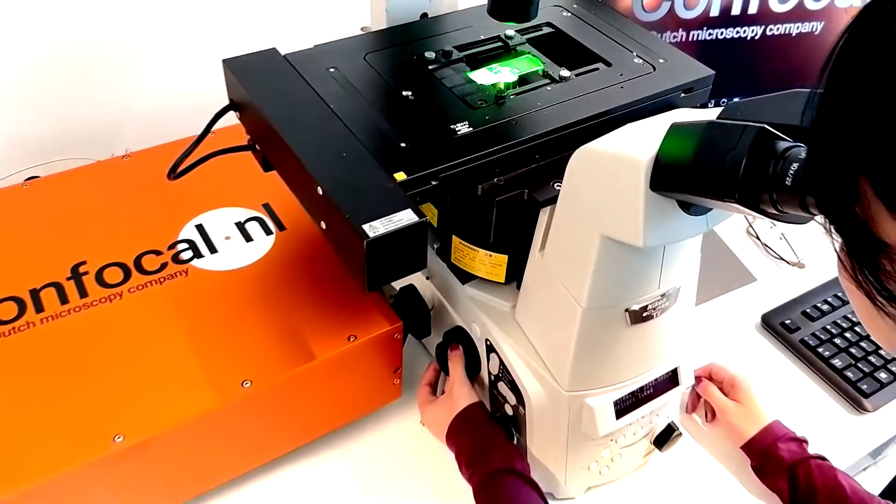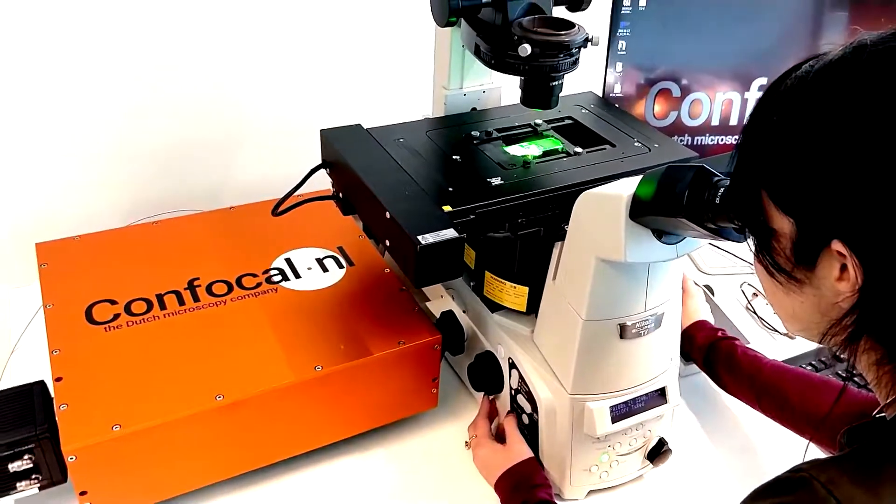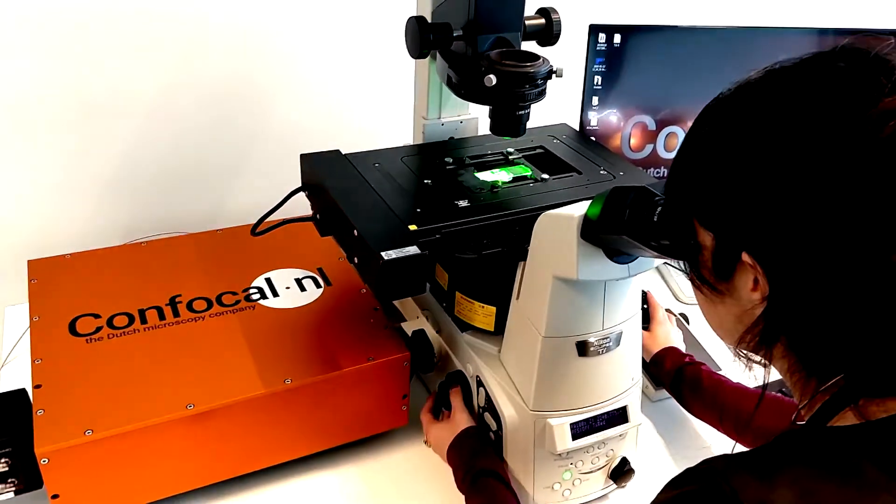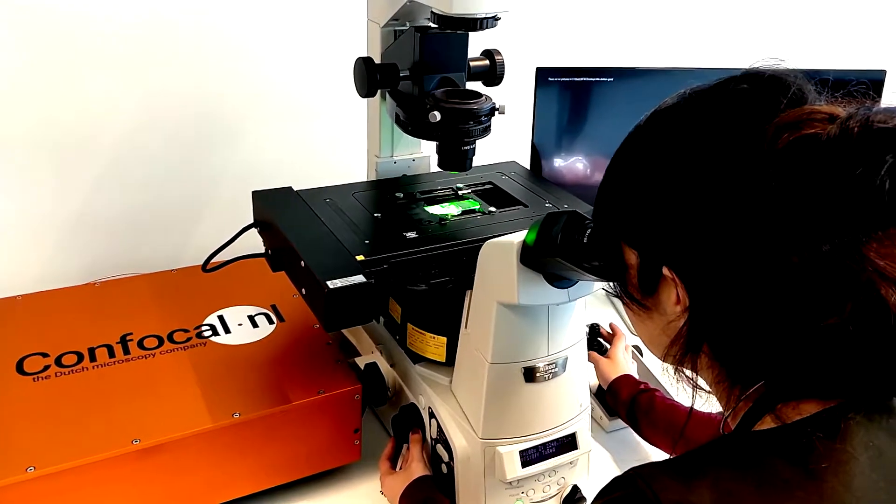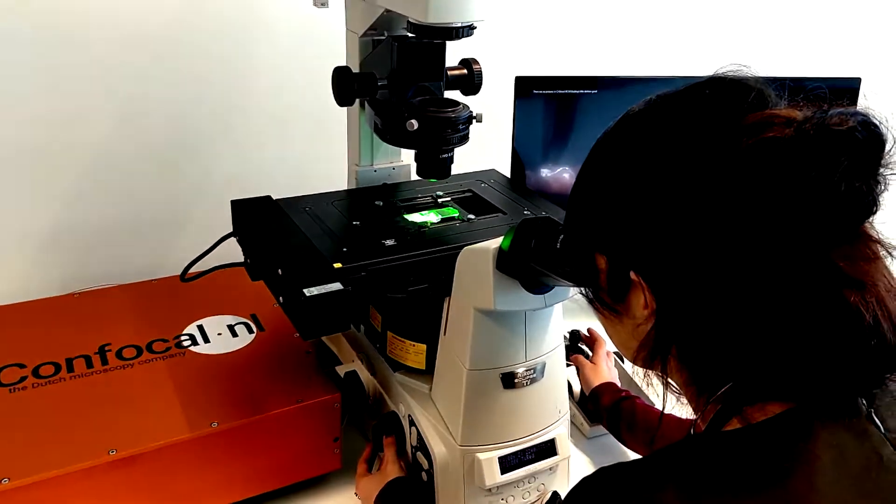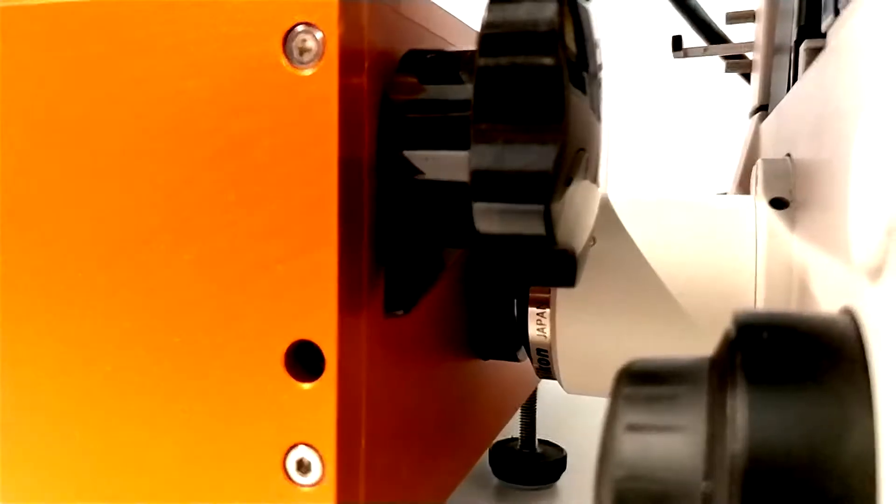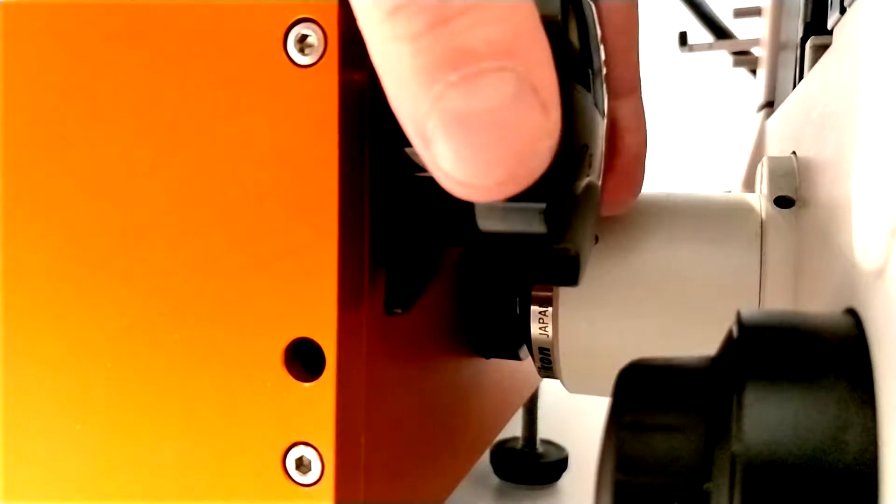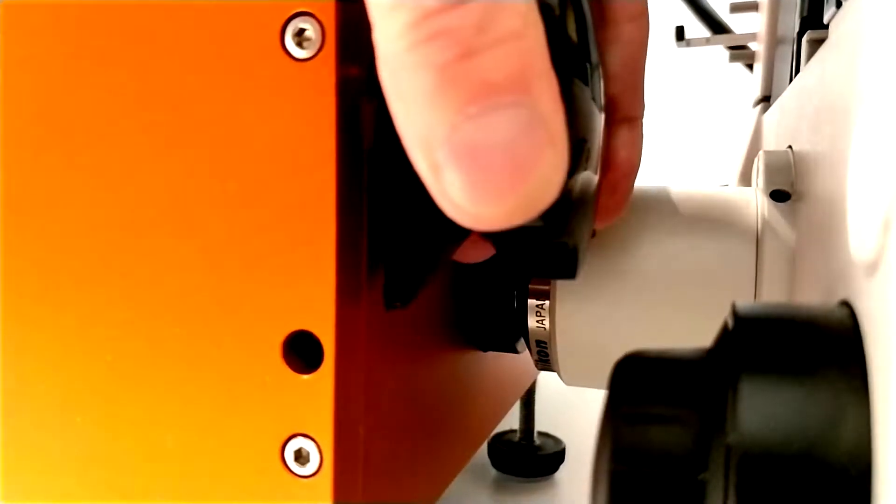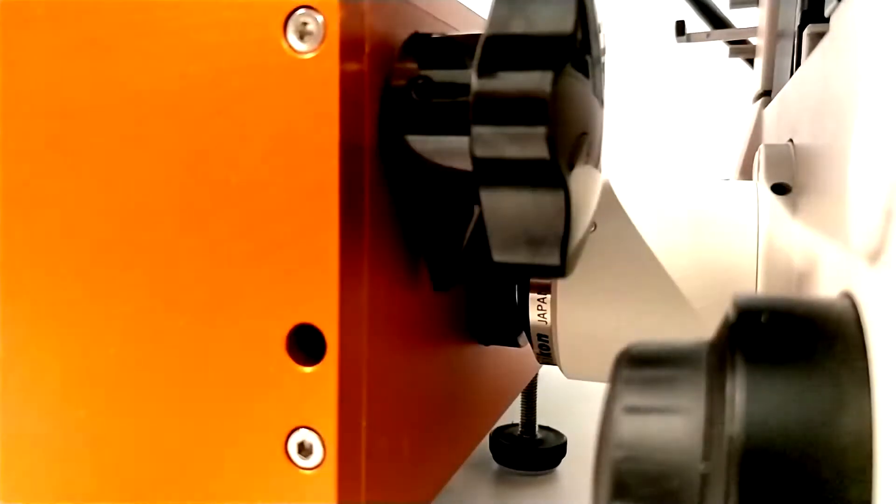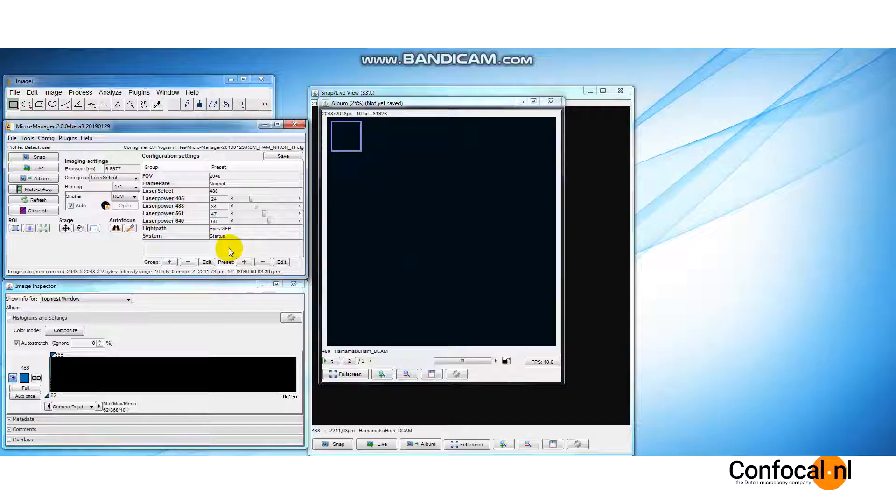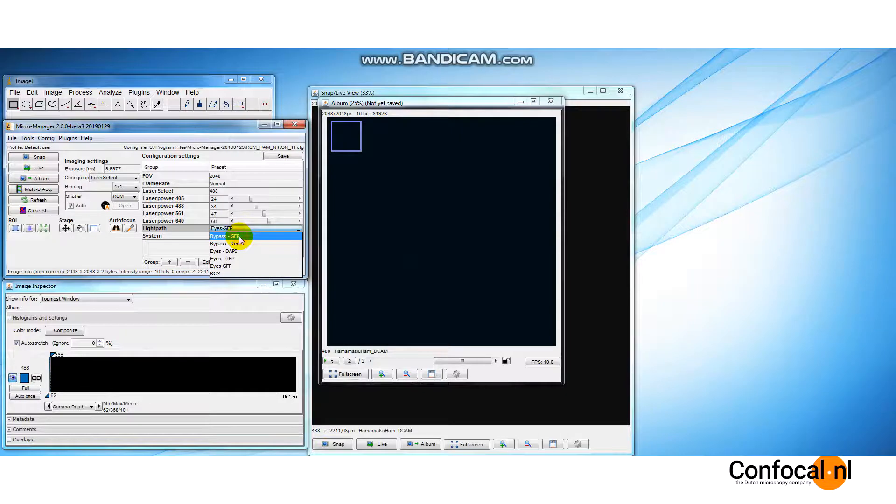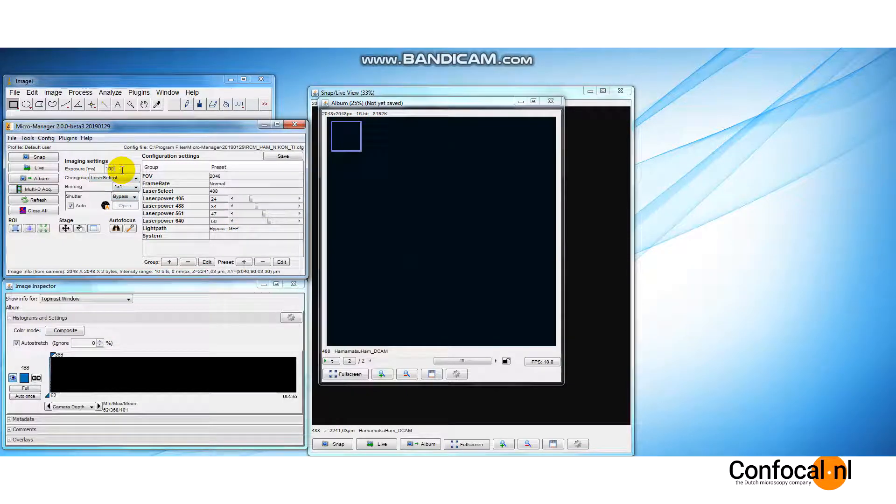You can make use of the eyepiece for a quick scan of your slide. With the bypass mode, you can scan the slide to find the region of interest. Without having to use the eyepieces, turn the knob on the RCM unit to change the light path to bypass mode. Select the bypass mode from the light path group. Set a low exposure time, say 100 milliseconds, to make sure we do not saturate the camera.